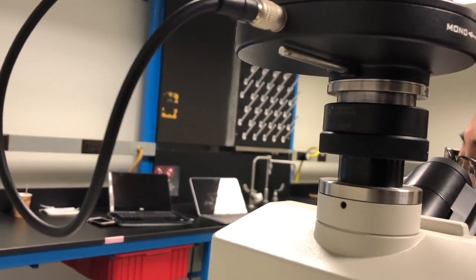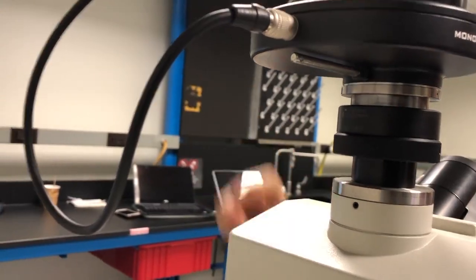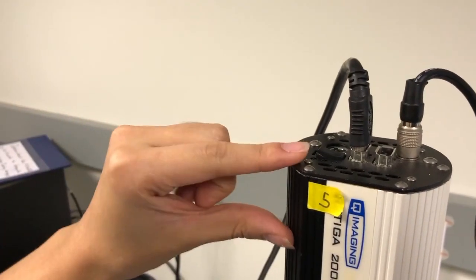Before turning on the camera, we have to make sure that the camera mode is in mono mode, and you know it's in the correct mode when the metal post is pointed back to the wall. So lastly, we're going to turn on the camera with the black power switch on the top left side of the camera.